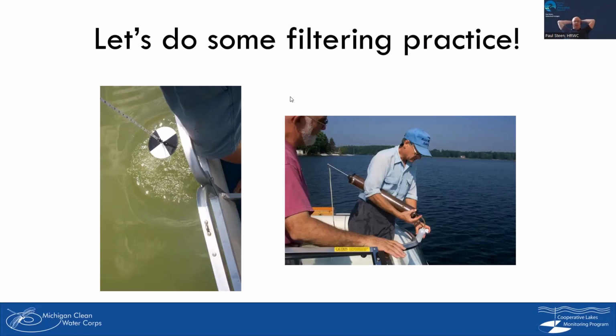Joe and Eric can chime in because I don't know what our SOP is there. So a normal standard would be sampling or filtering within 24 hours of collection. Okay. All right. And if, like you said, you're going to be gone for the weekend, we do have a window for sampling that is multiple days, so maybe you can shuttle it around and find a day that works.